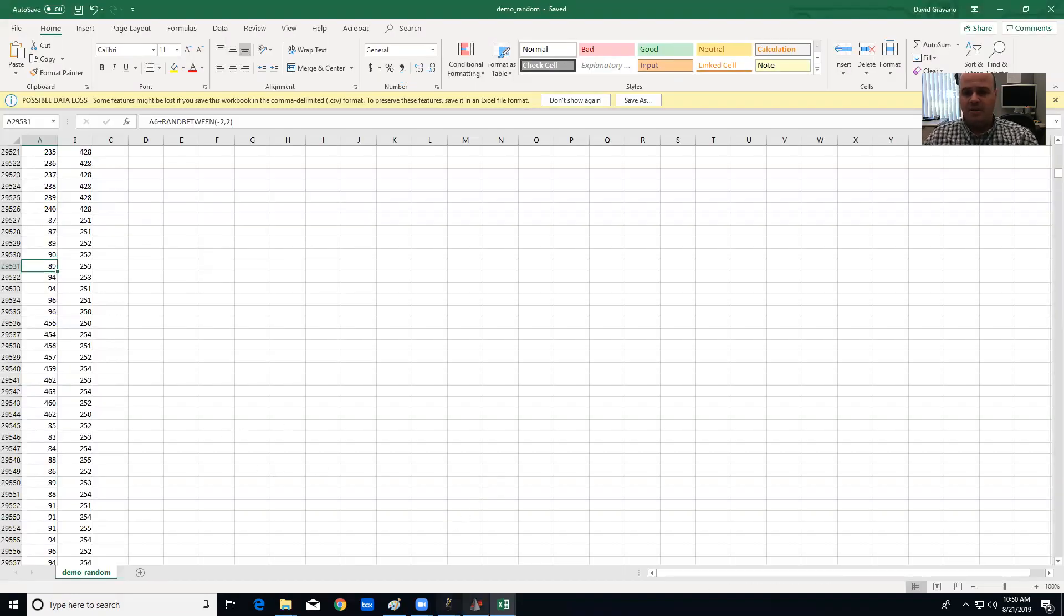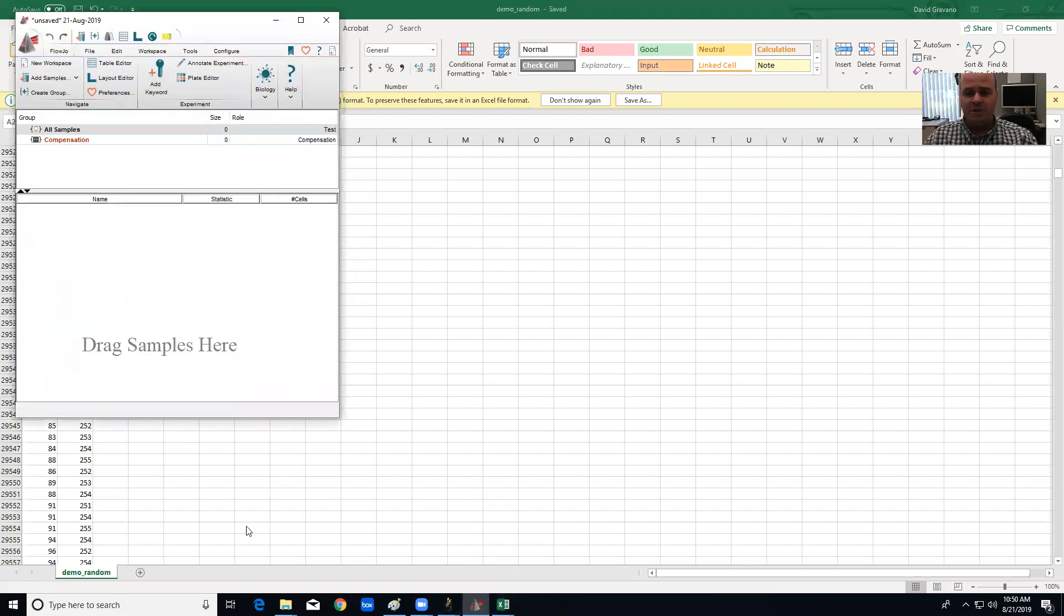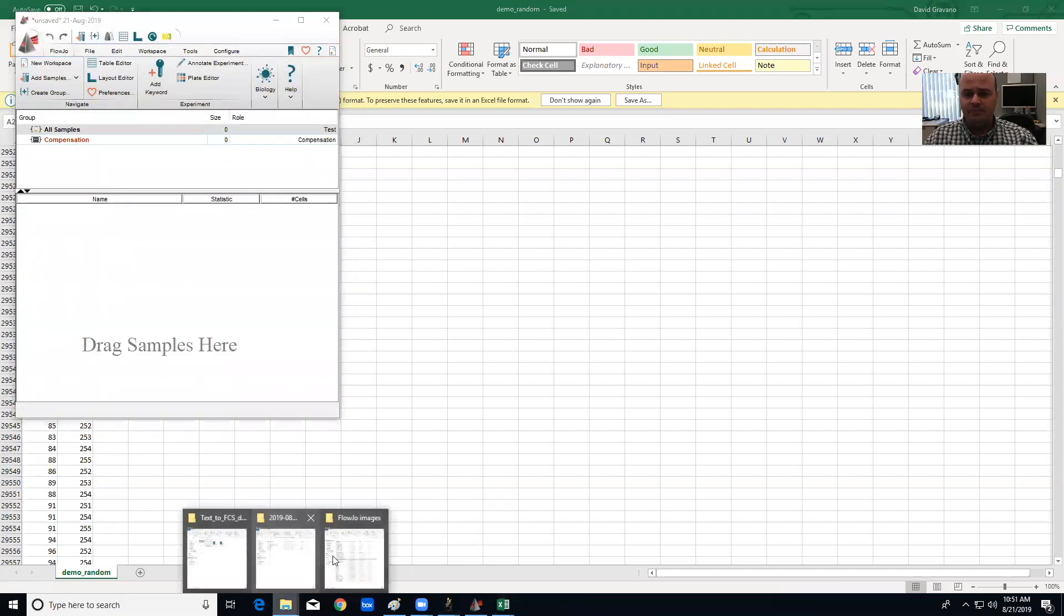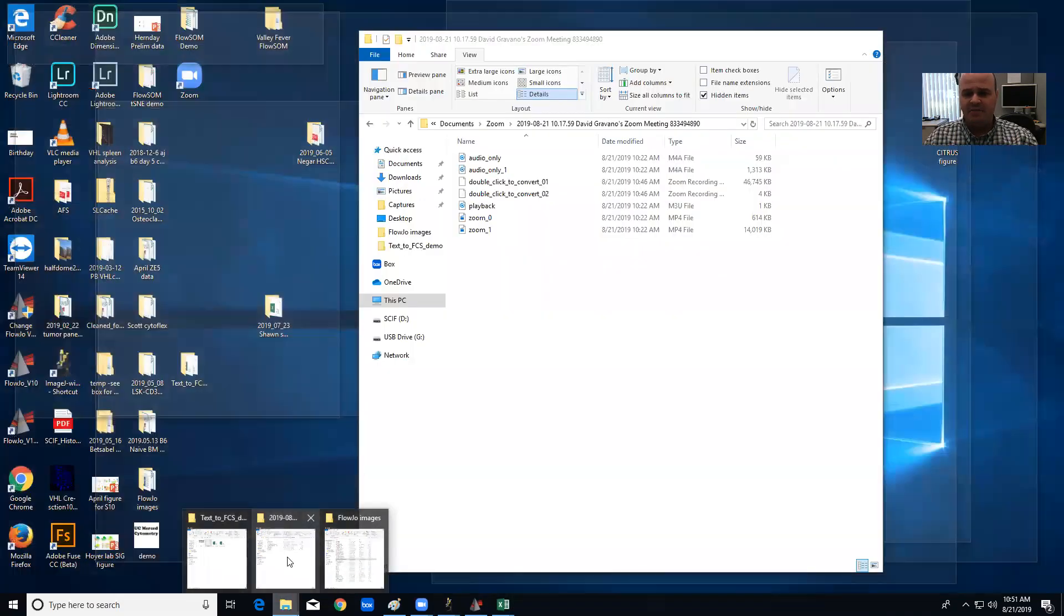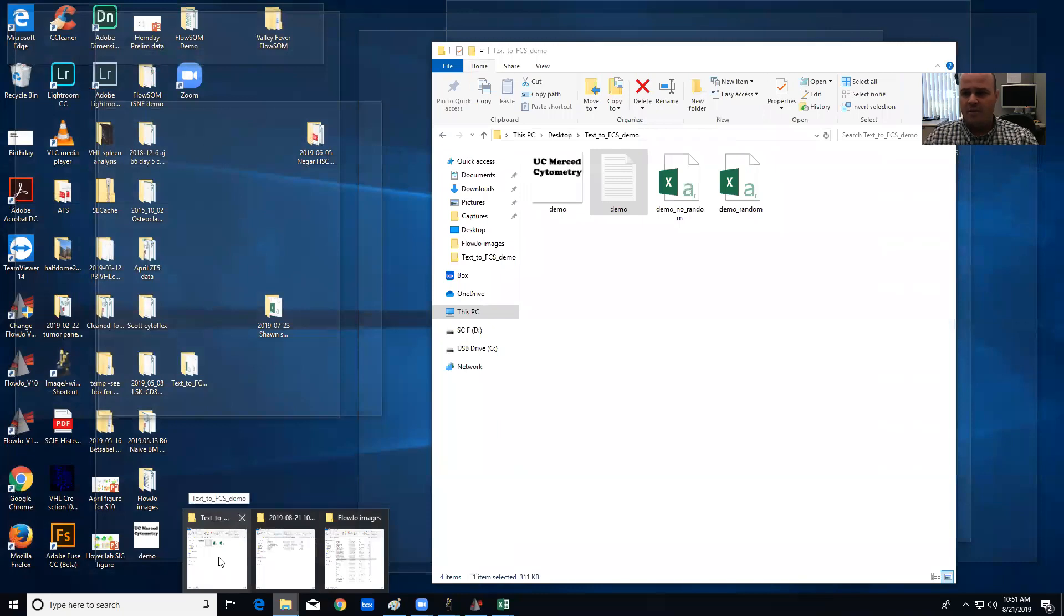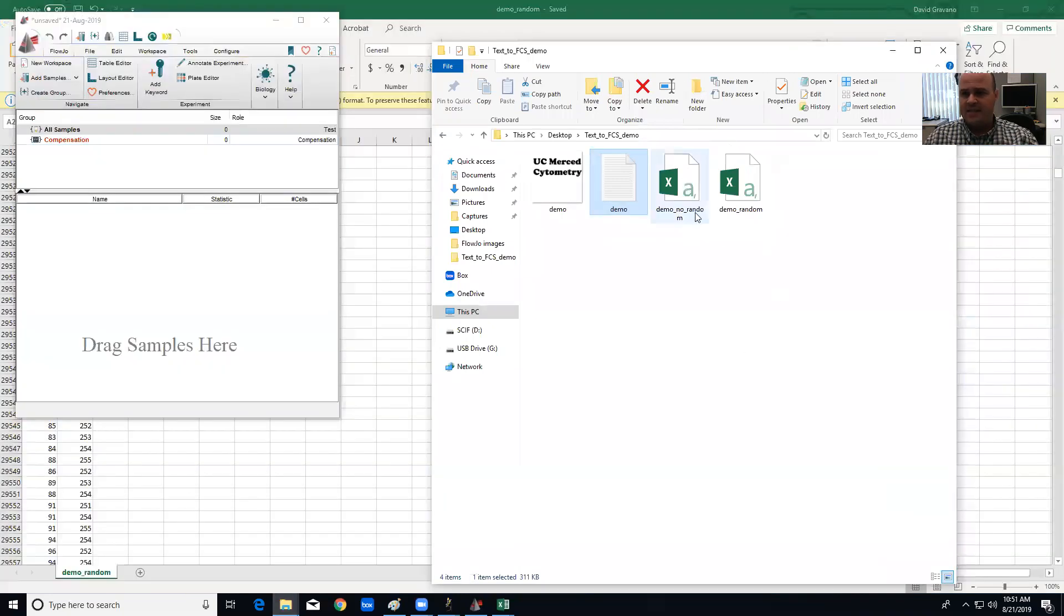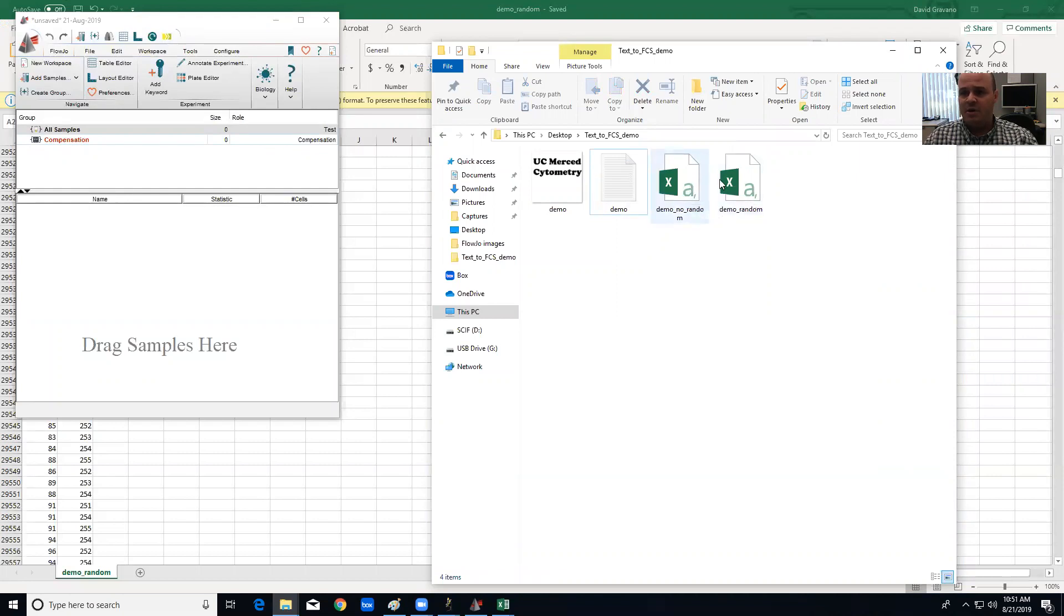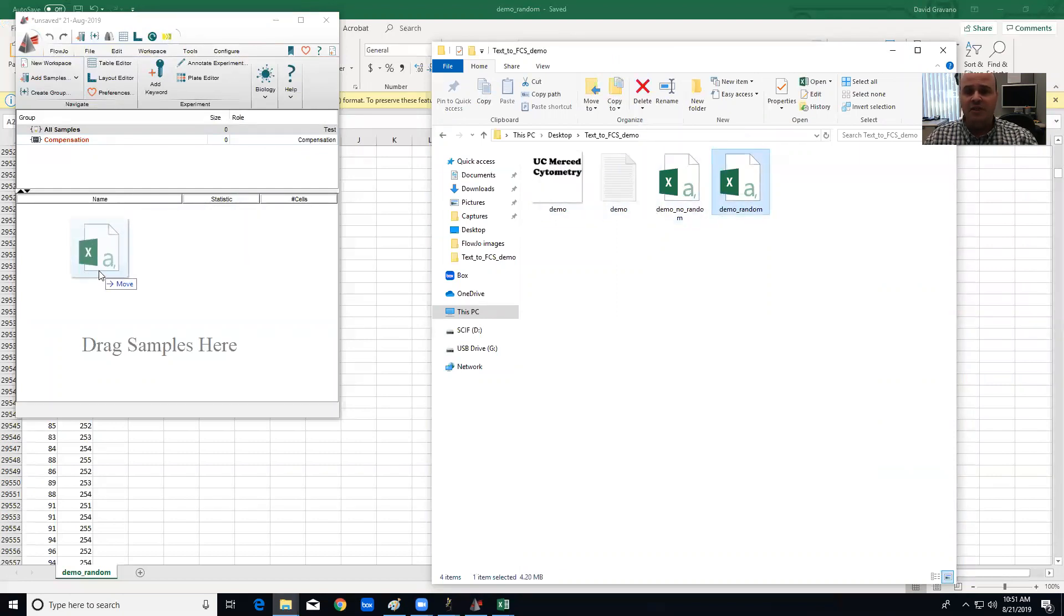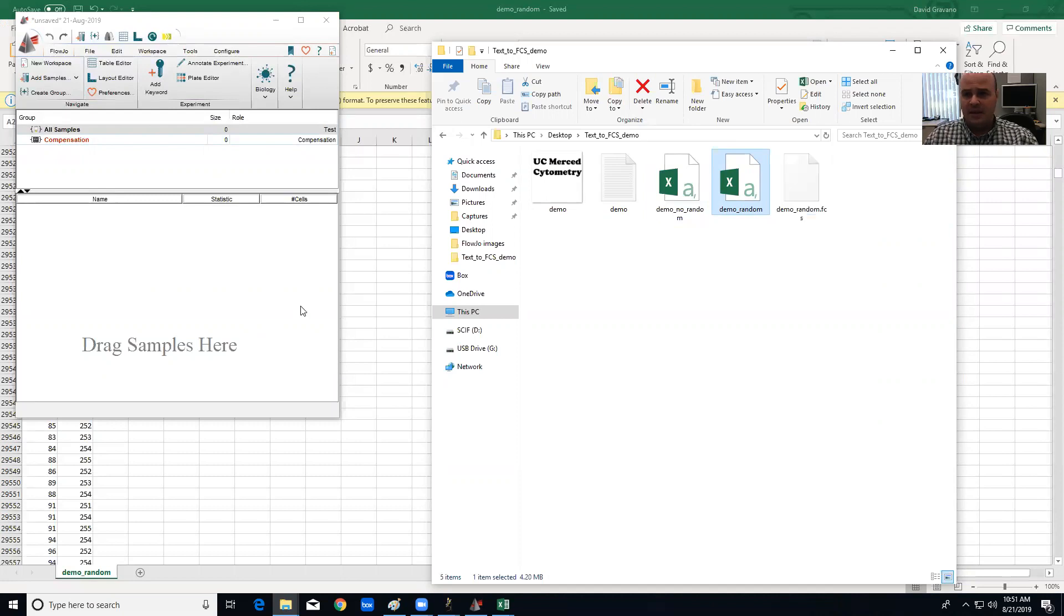From here I'm going to go into FlowJo now. So I'm going to open FlowJo and I'm going to take the folder where my CSV files are and I'm going to drag the demo_random file into FlowJo. I think it has to be version 10 or higher to do this.